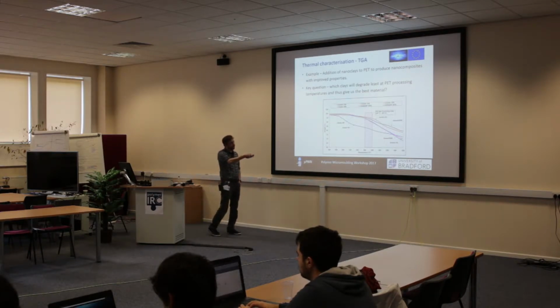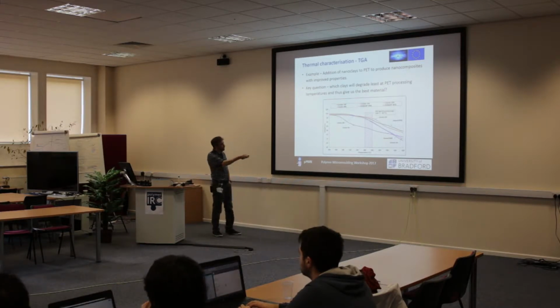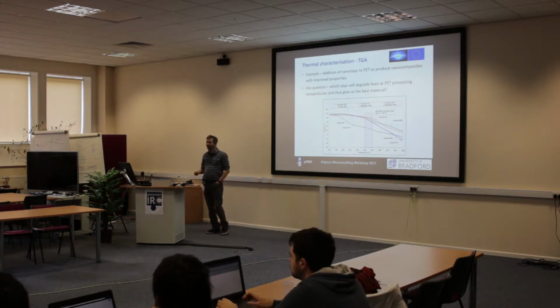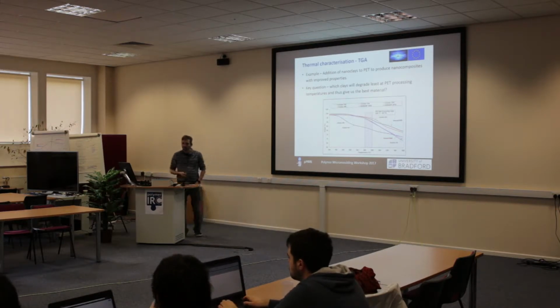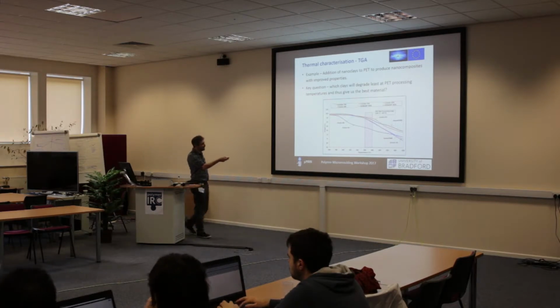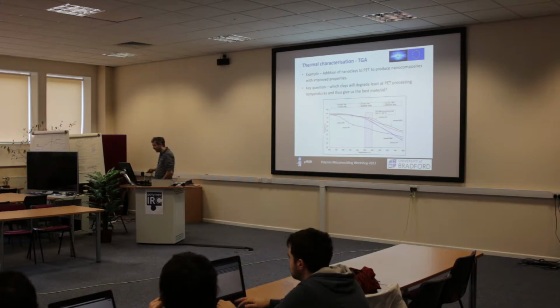One of the ones we were originally going to look at was this 10A, this particular form of clay, Montmorillonite, where you've lost 20% of your mass by the time you get to your process temperature. So we decided, right, okay, we will not use anything in there, but we will focus in on these three that are held within here, okay? So that's what TGA gives you.